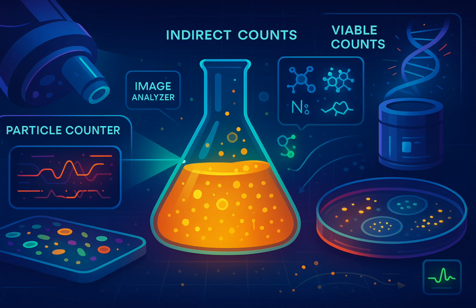Okay. And finally, biosensors. That's a broader term. Instruments designed to measure microbial activity rather than count cells directly. They might measure a chemical change caused by microbial metabolism, like a change in electrical current. The rate of change relates to the amount of active biomass, often quite specialized. Okay, so we've gone from microscope dots to light scattering, chemistry, ATP, DNA. Yeah, it's definitely clear there's no single best method. Absolutely not. That's the core message from these sources. The method depends entirely on the question and the sample.